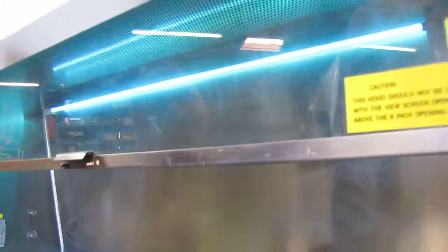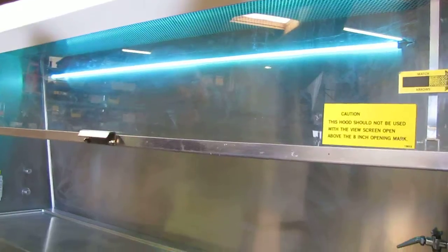And then we'll go ahead and also turn on — that's your UV light right there. So you can have either your fluorescent on or you can have your UV light.